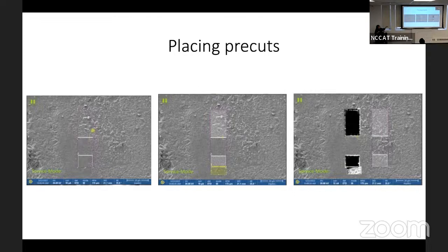For the smaller one, which is quote unquote the bottom, but it's actually the top later on. But it's actually the bottom because I do a 180 scan rotation because I can't mill through the ceiling. It doesn't make any sense. That one, if you cut through it, that's there for when you actually put it into the Krios and you're doing your tilt. So if you have grid bar at that end, when you tilt to the higher tilts, you're gonna run into the grid bar. And that's unfortunate. So you want that one to be like fairly large, but not too big. So that's why it's smaller than the topmost one.